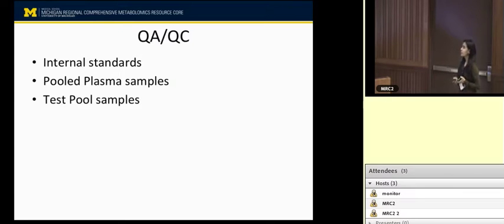The lipid classes, mainly three big classes that are covered, are glycerolipids, glycerophospholipids, and sphingolipids. Glycerolipids mostly elute in positive mode. Glycerophospholipids mostly elute in negative mode, but glycerophosphocholines and glycerophosphoethanolamines appear in positive mode as well. Sphingolipids: we see sphingomyelins in positive mode. Ceramide phosphates we see in negative mode, but we don't see that many. There's one more class, which is ceramides. We see those mostly in positive mode.